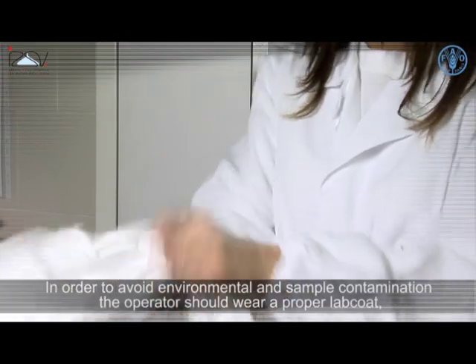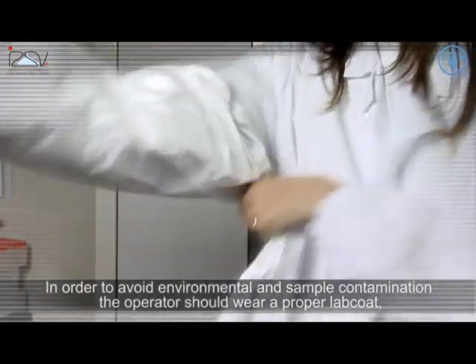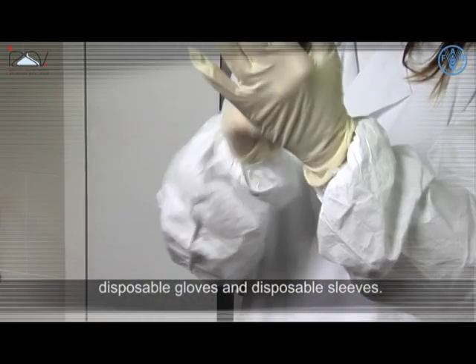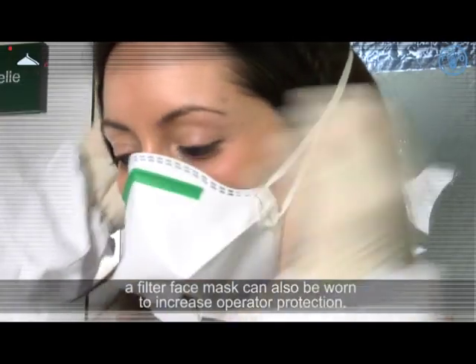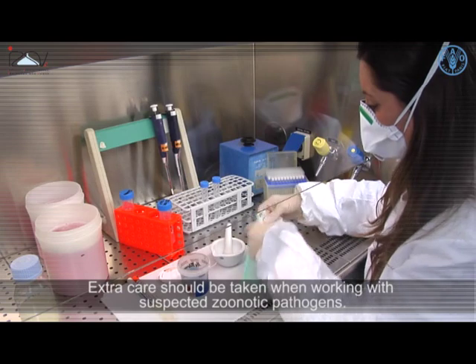In order to avoid environmental and sample contamination, the operator should wear a proper lab coat, disposable gloves and disposable sleeves. A filter face mask can also be worn to increase operator protection. Extra care should be taken when working with suspected zoonotic pathogens.